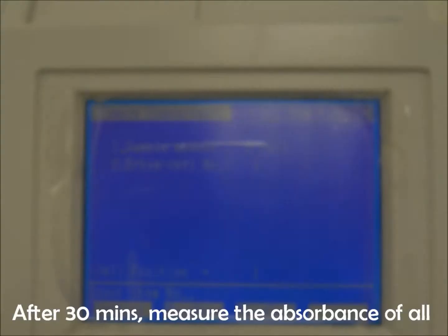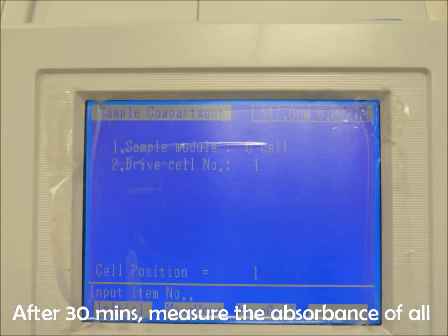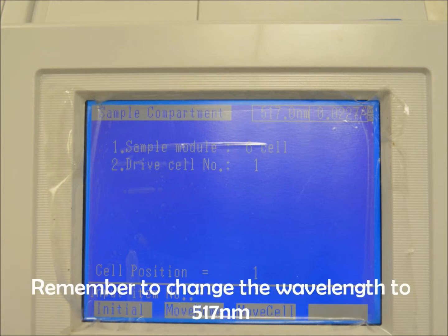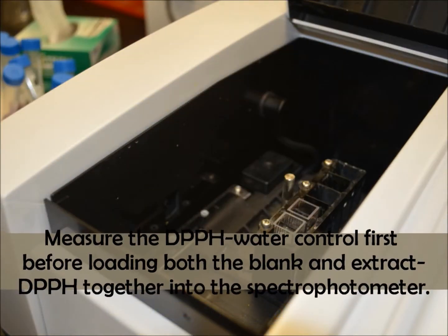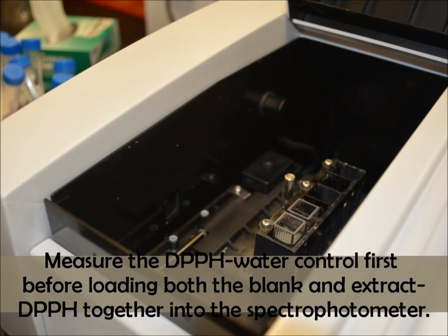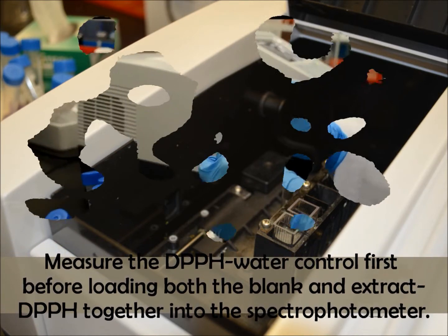After 30 minutes, measure the absorbances of all tubes using the spectrophotometer. Remember to change the wavelength to 517 nanometers. Measure the DPPH water control first before loading both the blank and the extract DPPH together into the spectrophotometer.